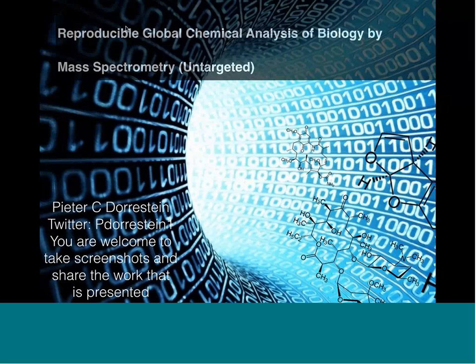Great, thank you so much. The next question is, how do you export the GNPS data sets into Qiita?